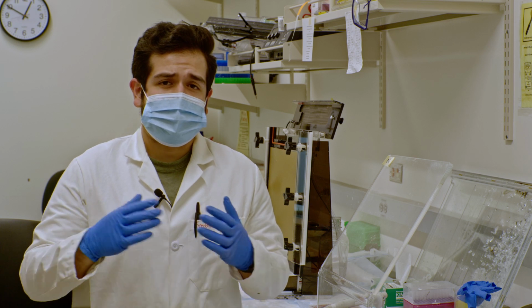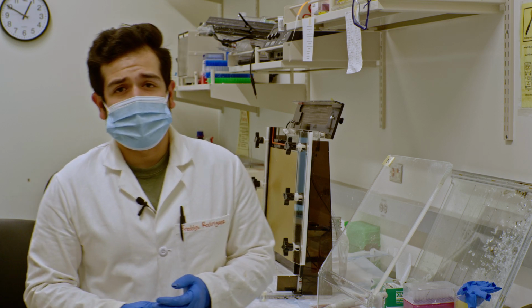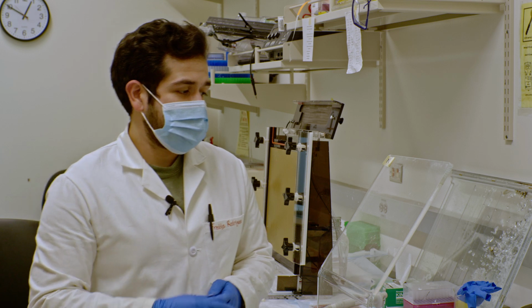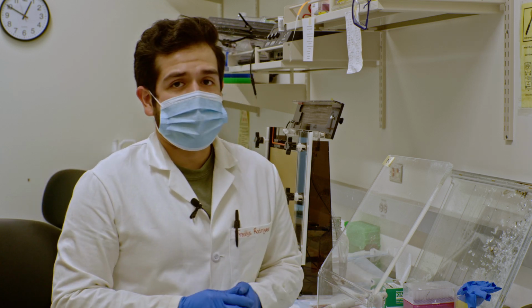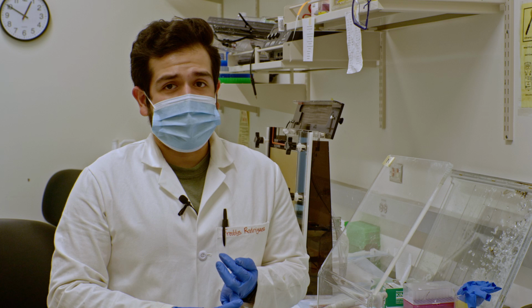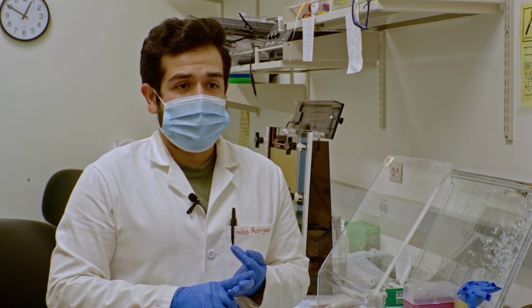So what I like to do before I even come into the room is to prepare the samples. These samples are 3 different things in my case. The first one is a sample that contains T4 PNK within a T4 PNK buffer with the amount of DNA primer that I want to use. In this case, let's say I have about 500 picomoles. The reaction volume of this is about 20 microliters in total.